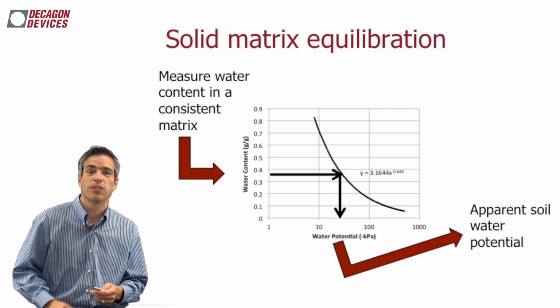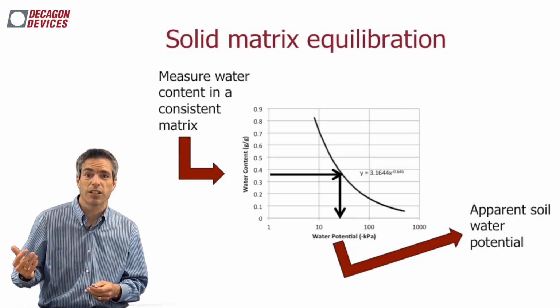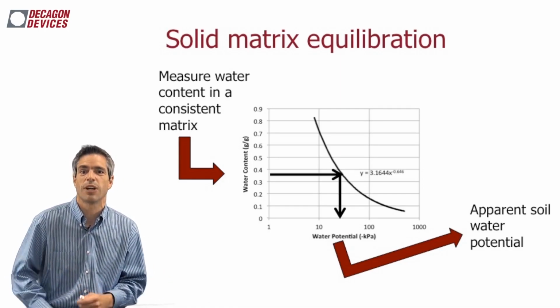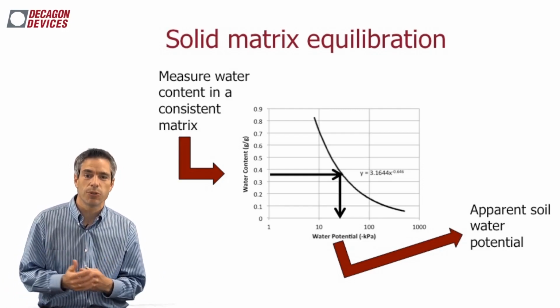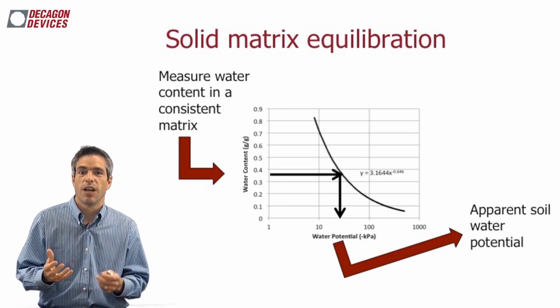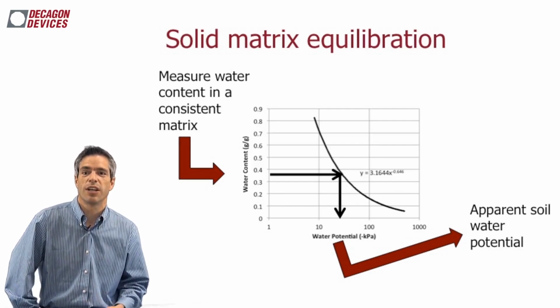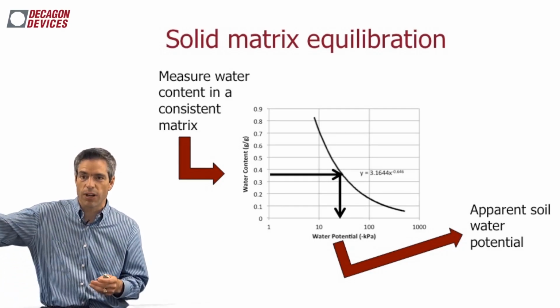So we developed this soil water characteristic curve, something that Doug talked about last week, and a series of words I'm going to say multiple times through the seminar. We often abbreviate that SWCC. We create that for our matrix. We start then by measuring the water content. We come over to this relationship line that we've created right here in the middle.